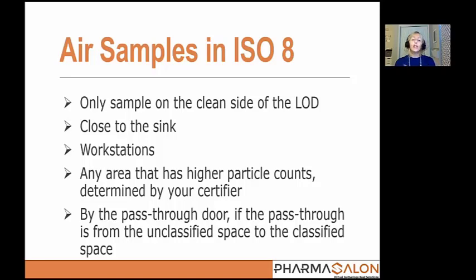Now, as I mentioned earlier, if the bugs were there, we want to find them. But at the same time, we already know that we have a huge contamination source in there, and we should just treat it as such. So if you can be within an area to sample that gets you an idea of what could be coming from the sink from a contamination standpoint, but not sampling on top of the sink, that gets you that balance that you're looking for.